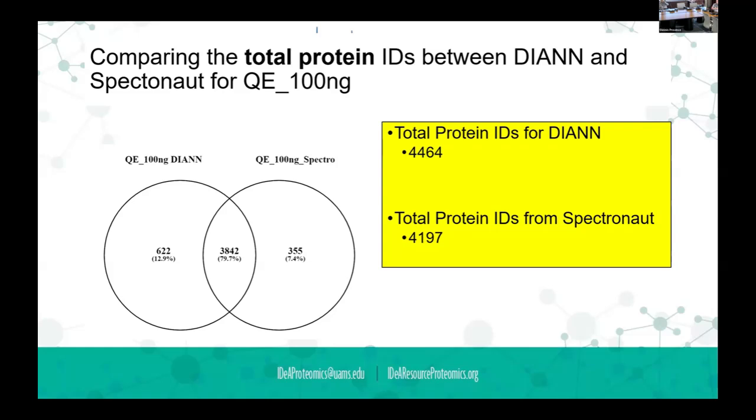This is something people can do. The numbers are a little higher here than they would be with just a cell lysate, because you're picking off the abundant proteins from the 2 different cell lines. I don't know how many it would be with just one of the cell lines, but probably 3,000, 3,500 or something like that.